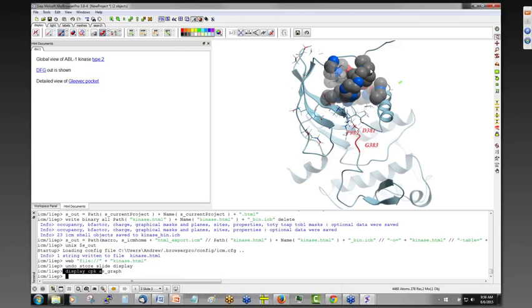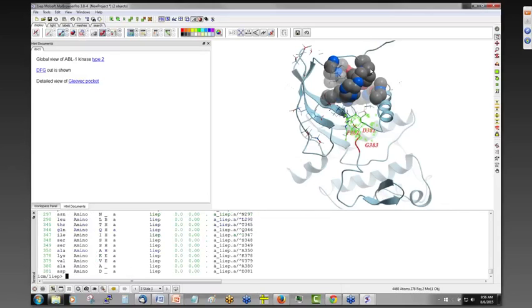So I displayed CPK as AS_graph, which is a selection. If you make a selection here and type res AS_graph, you can see all the residues that have been selected. Or you can say something like string res AS_graph, and then you can see directly the residues here. Everything is fully interactive.